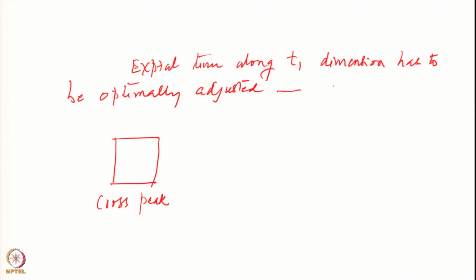Okay. So this is in COSY and DQF COSY, we have seen that the cross peak for a 2 spin system has this kind of structure, right, for a 2 spin system, and the separation between them is the coupling constant. Now we will be able to see all these 4 components only if you have enough resolution, if these lines are properly separated.